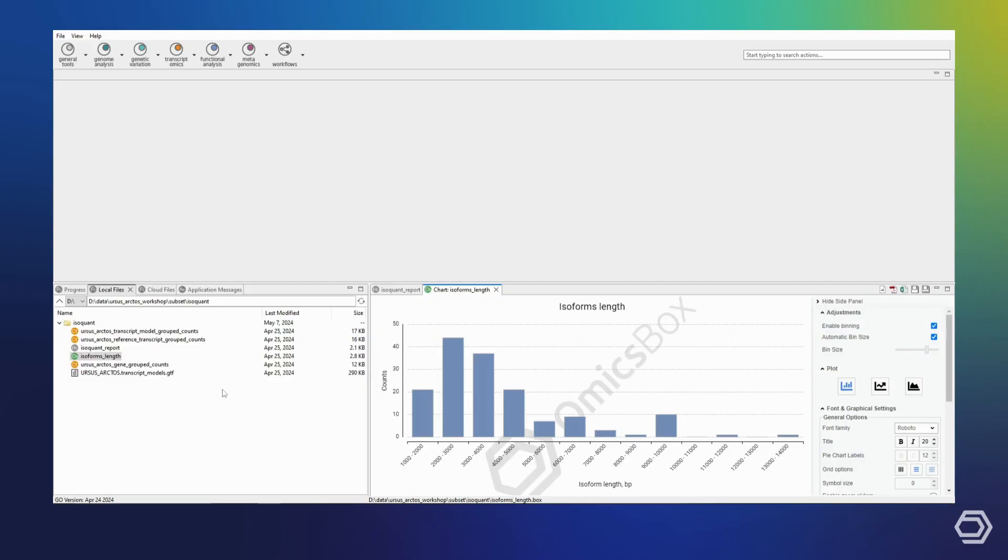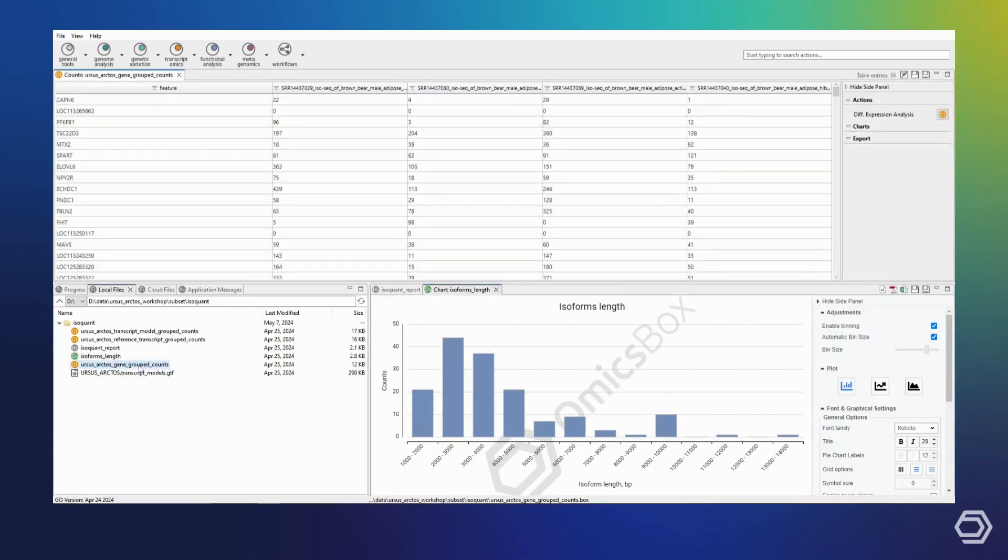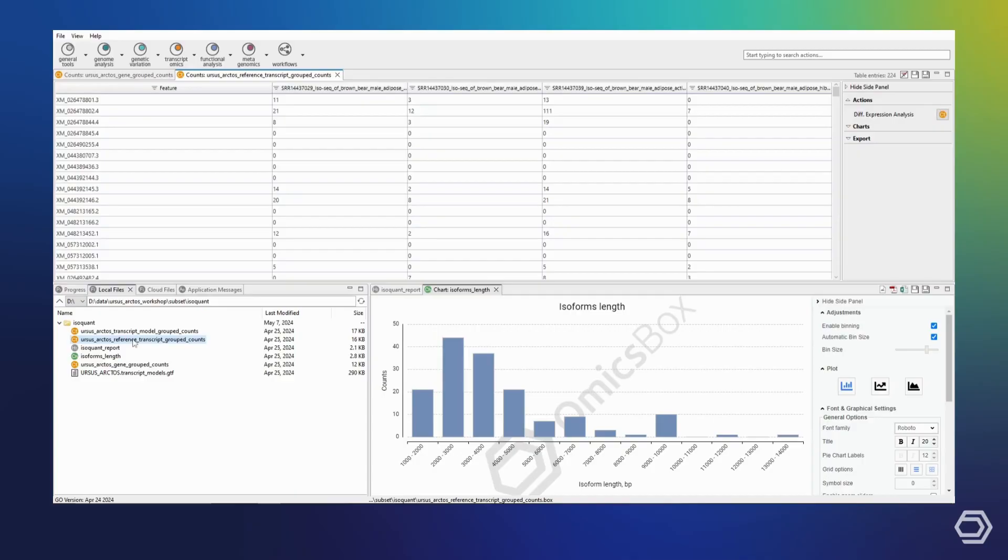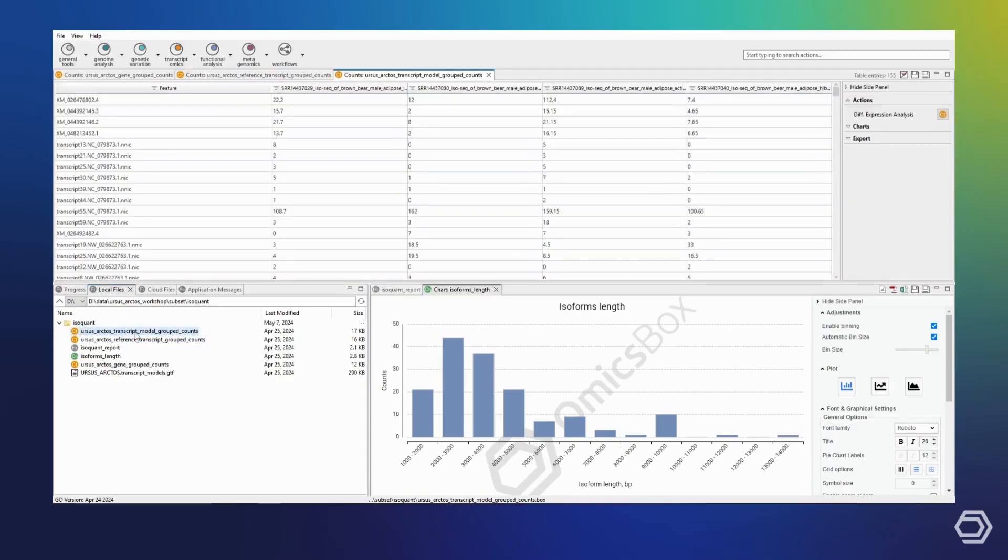Then, we also receive the selected quantification outputs. We have the reference-based gene as well as transcript-level quantifications, as well as the transcript-level quantification based on the isoforms identified by IsoQuant.